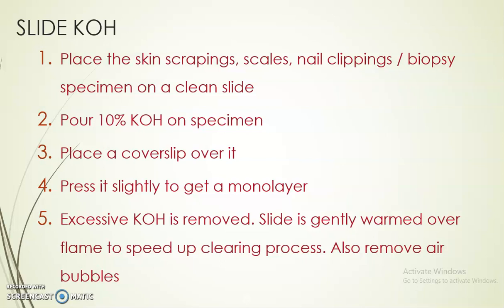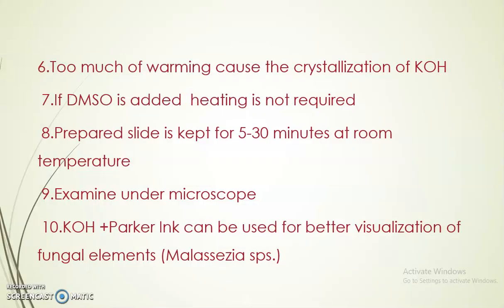Then place a coverslip and gently press it to get a monolayer. Excessive KOH must be removed and the slide is warmed gently. This warming is done to speed up the clearing process and also helps to remove air bubbles. Too much warming can cause crystallization of KOH, so we must be careful. If we are adding DMSO, we can observe the specimen without heating. The prepared slide is kept for 5 to 30 minutes at room temperature and can be examined under the microscope. A special preparation, KOH plus Parker ink, can be used for better visualization of fungal elements, especially in the case of Malassezia species, which is a pathogen causing superficial infections in human beings.